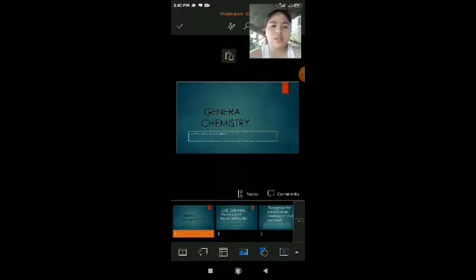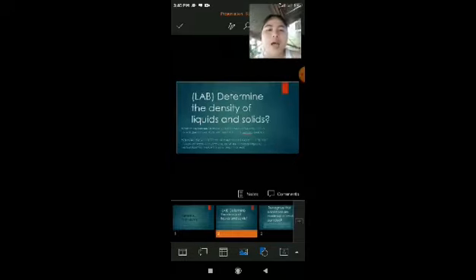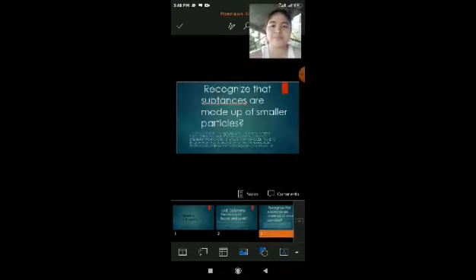For the General Chemistry Measurements Lab: determine the density of liquids and solids. Liquid: to measure the density of a liquid, do the same thing you would for a solid and measure how heavy it is for the amount measured. Density is a physical property of a liquid and solid. We can define density as the amount of mass in a given volume. To determine the density of a solid experimentally, we must measure the mass of the solid using a balance.